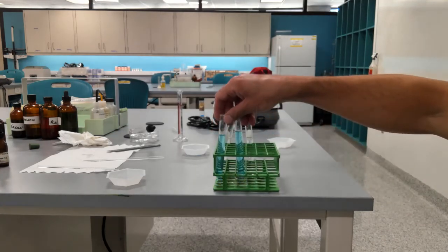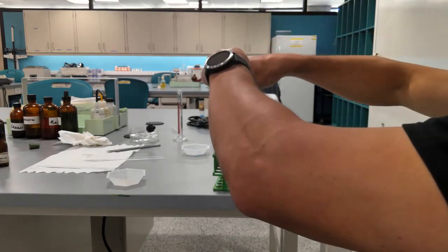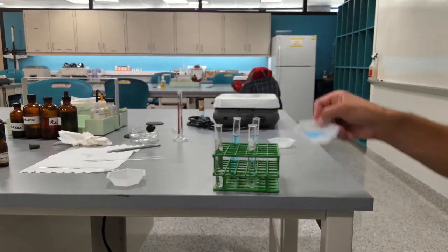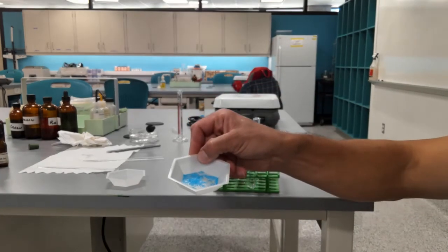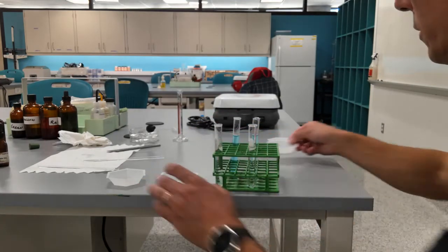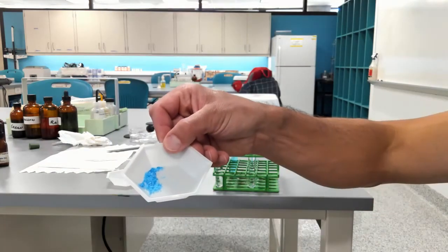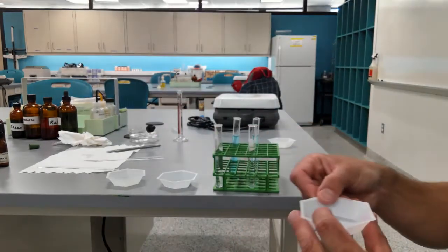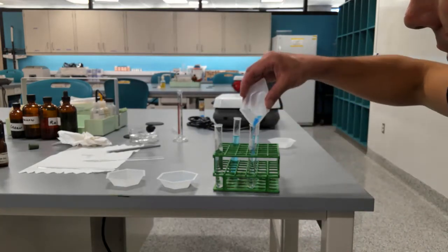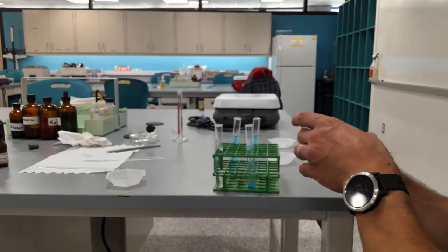Now, the next experiment that we're going to be doing is we're going to try to dissolve the nice, flaky copper sulfate versus pretty rough and crude crystalline copper sulfate. So I'm going to put crystalline copper sulfate here, and I'm going to put the flaky one here.